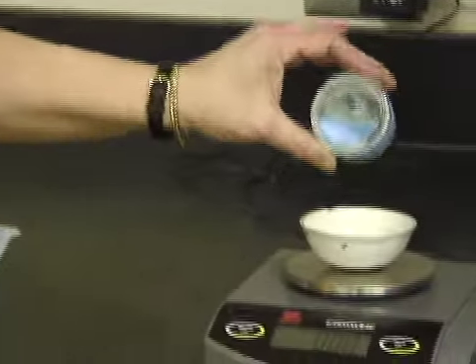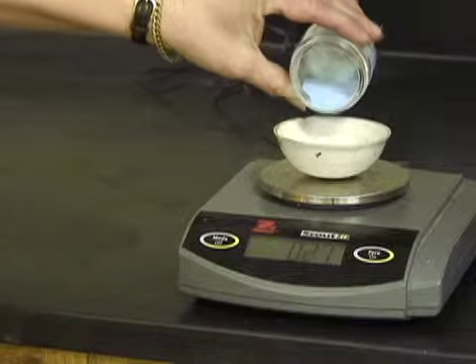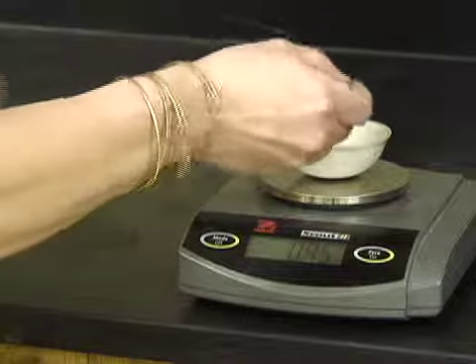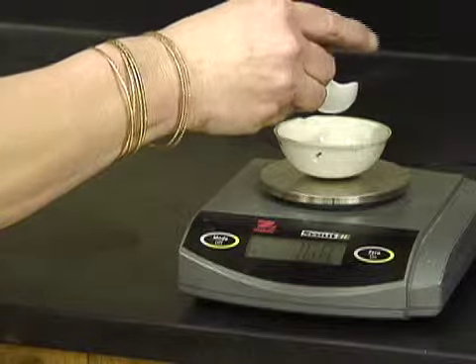Okay, so here we go. We're going to measure out 2.00 grams, and I can put this here a little bit. I could also use my spoon when I want to become more exact. Oh, we're over a gram. Getting close.